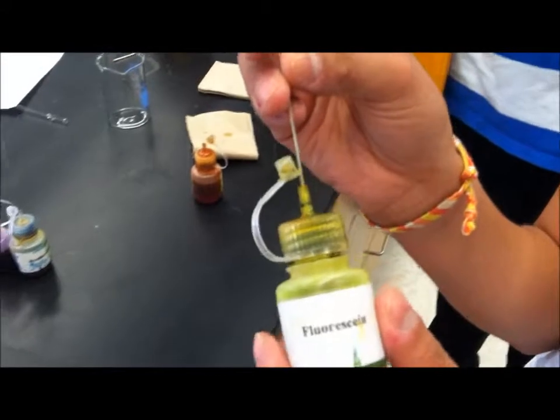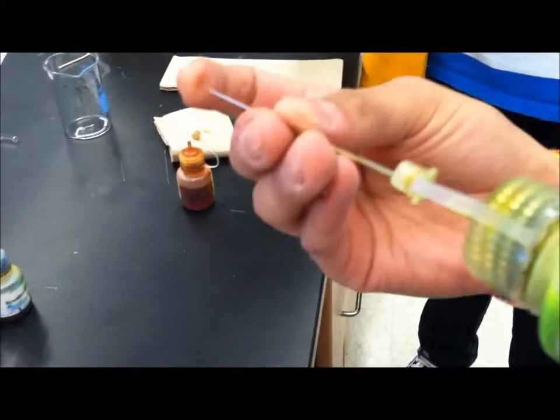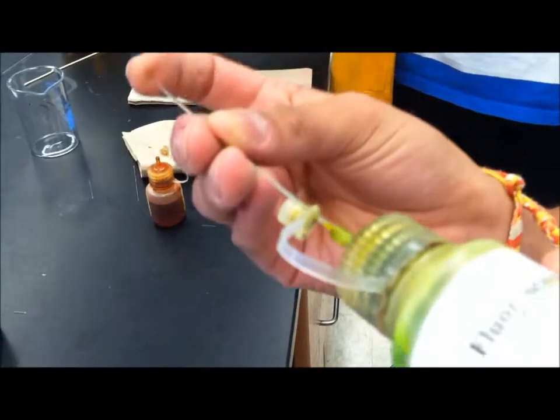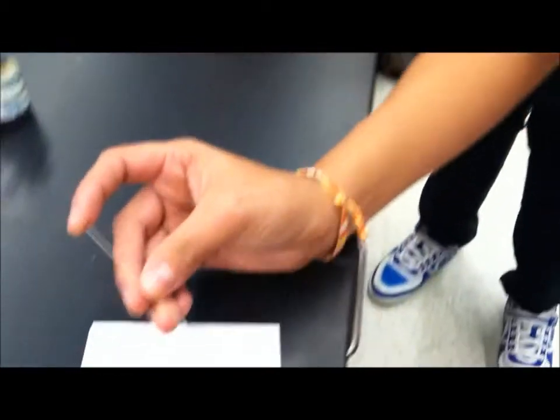Next, we will take a sample of fluorescein and place a dot onto the paper. Squeeze some of the substance into the capillary tube and place a small dot on the lines.